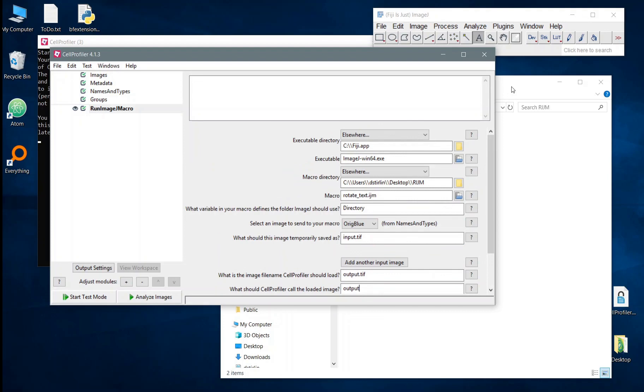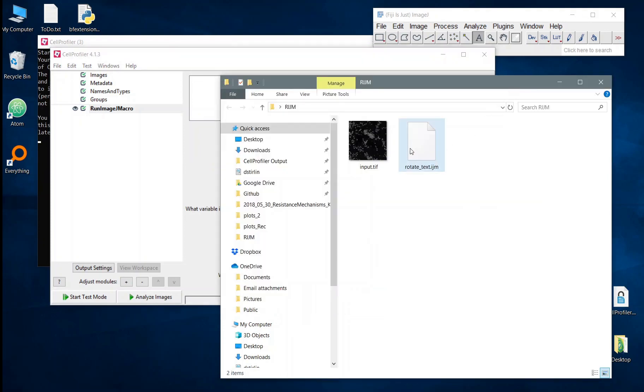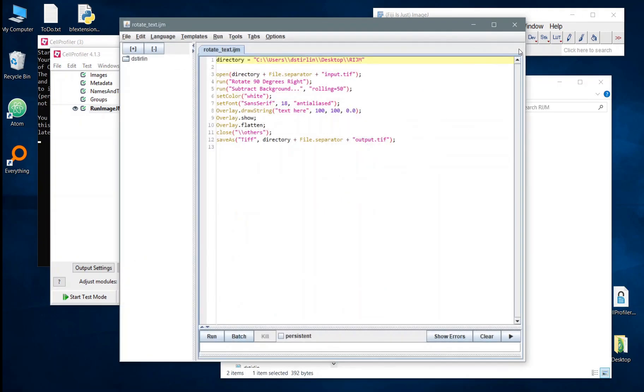So let's take a look at this macro briefly. I'm just going to load up the macro into ImageJ and we see what we have here is just a basic string of commands which I think rotates the image, applies the background subtraction and also adds a little bit of text on. Some of these functions are available in CellProfiler but the important thing to show here is the flexibility that this module has.